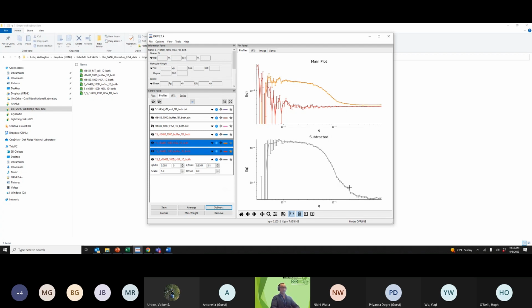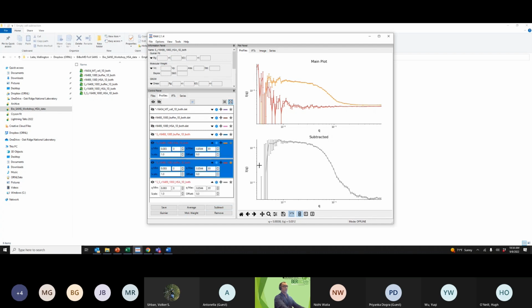That is another type of interaction that happens with those macromolecules that is not going to give you data, it is going to give you more noise on the final scattering profile. So the way to correct for this difference, you can see there is also a small mismatch on the data.